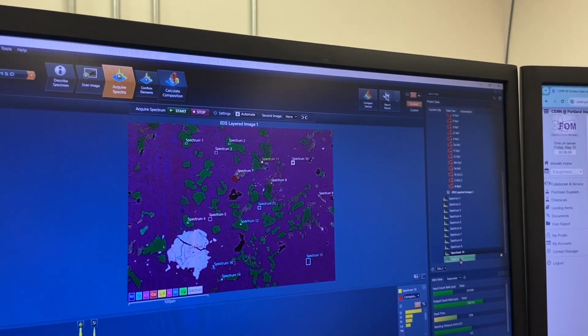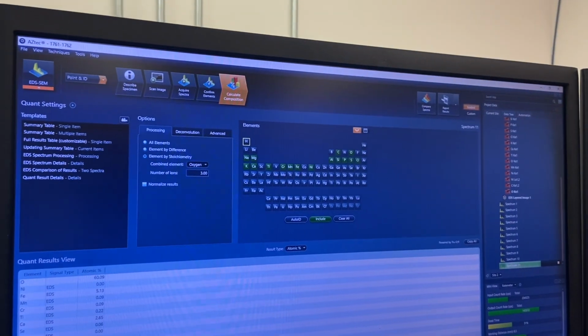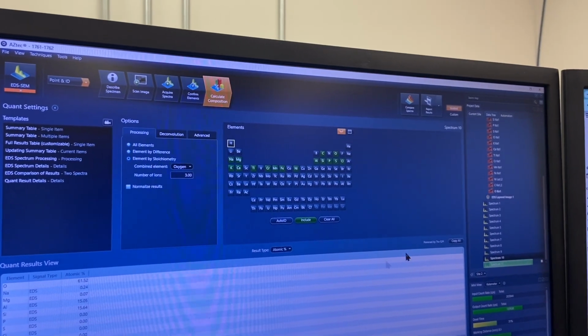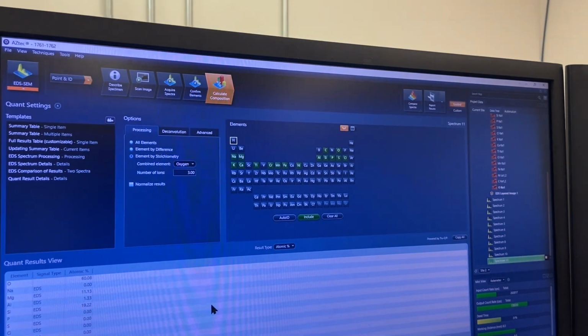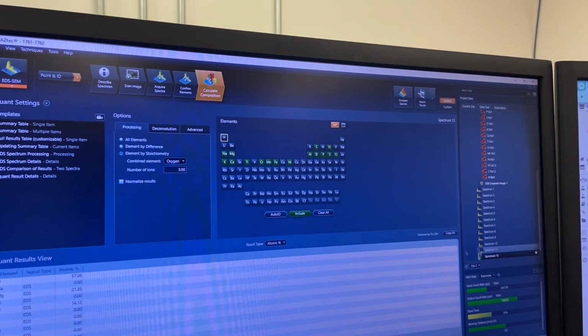10, 11 right here. So this is a pyroxene. Maybe that's what it's... No, sorry, not that one. It's 11. So that looks like a pyroxene, looks like a pigeonite, a little bit of titanium, a little bit of chromium. That all makes sense. Let me go back to 11 here.